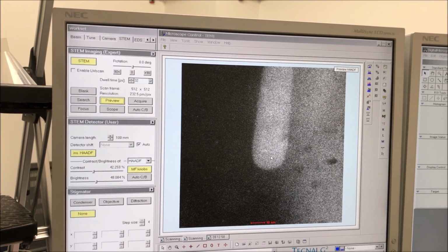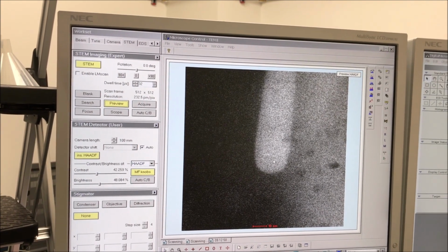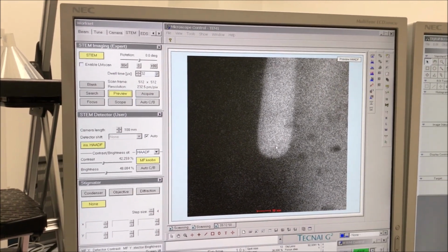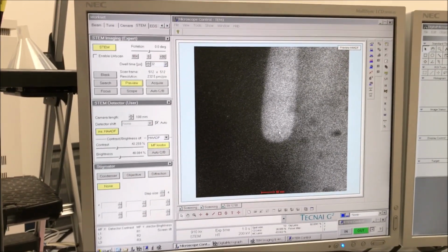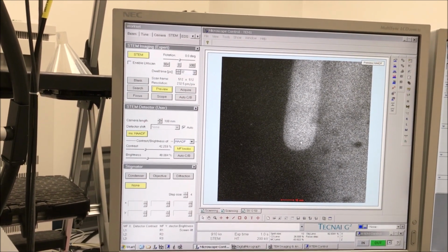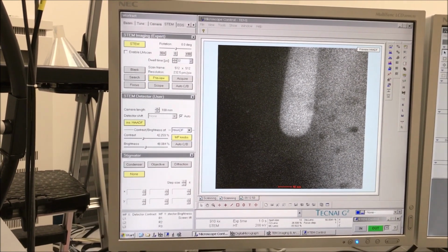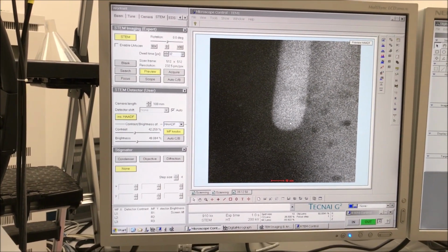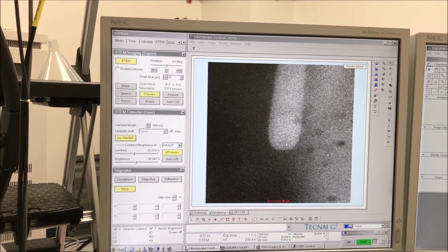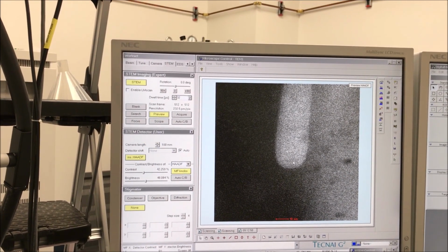This is usually mostly an issue when you're doing atomic resolution STEM or high resolution, aka lattice imaging, or doing CBED. These are scenarios where you're using a fine probe or you're putting high current into a really small area. This can also be an issue when you're doing EDS in STEM mode with high current. This usually isn't something that manifests when you're doing weak beam dark field or 2-beam imaging. So it's usually with high resolution imaging applications, although as I just said, it can happen when you're doing things like EDS in STEM mode as well.